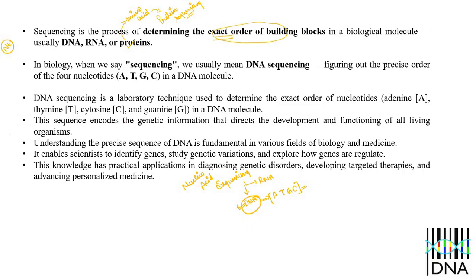DNA sequencing is the laboratory technique used to determine the exact order of nucleotides, which may be adenine, thymine, cytosine and guanine, in DNA molecules. This sequence encodes the genetic information that directs the development and functioning of all living organisms.